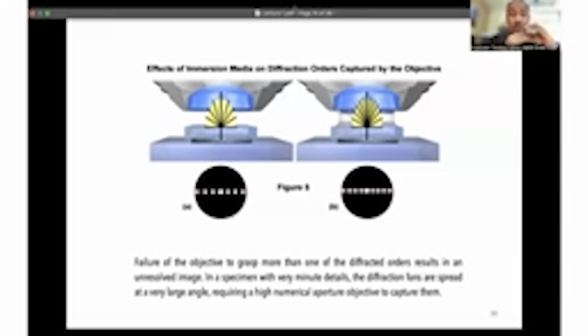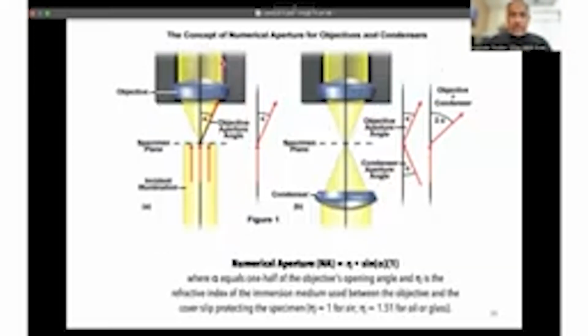Right, and that allows you to see things now in such a way that you couldn't clearly some time back. In a loose sense, that's what's happening with microscopes as well, right? And the idea here is to be able to collect more light and send it into the objective of the microscope, so that we are able to see things better, right?